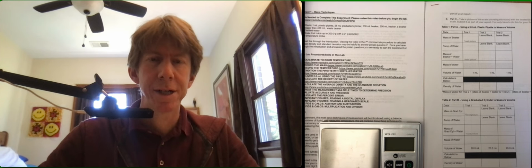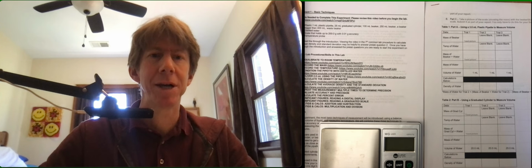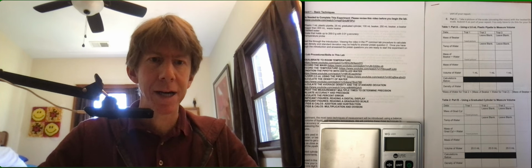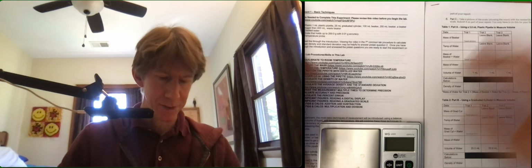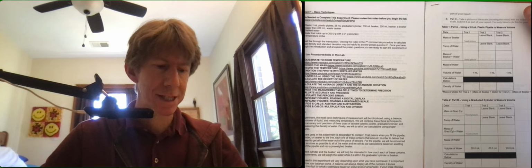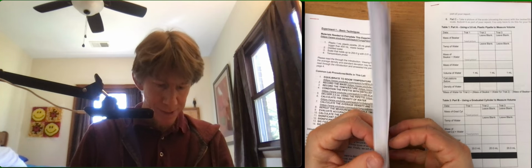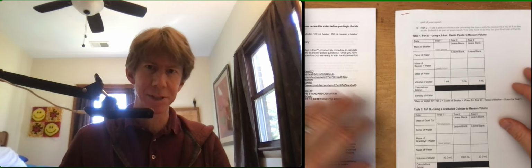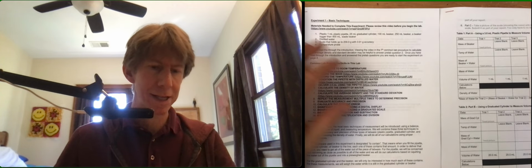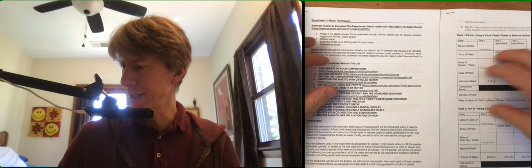This is a recording of Experiment 1 Basic Techniques using a 1 mL pipette. And I'm going to take you through how to do this experiment from beginning to end. I've got my scale, but let me move that out for a second. I've got the handout portion of it, and it's actually just the first 8 pages all together. And then I've got pages 9 and 10 with my data tables stapled separately because I want to make sure that I can see what I'm doing and write things down both at the same time.